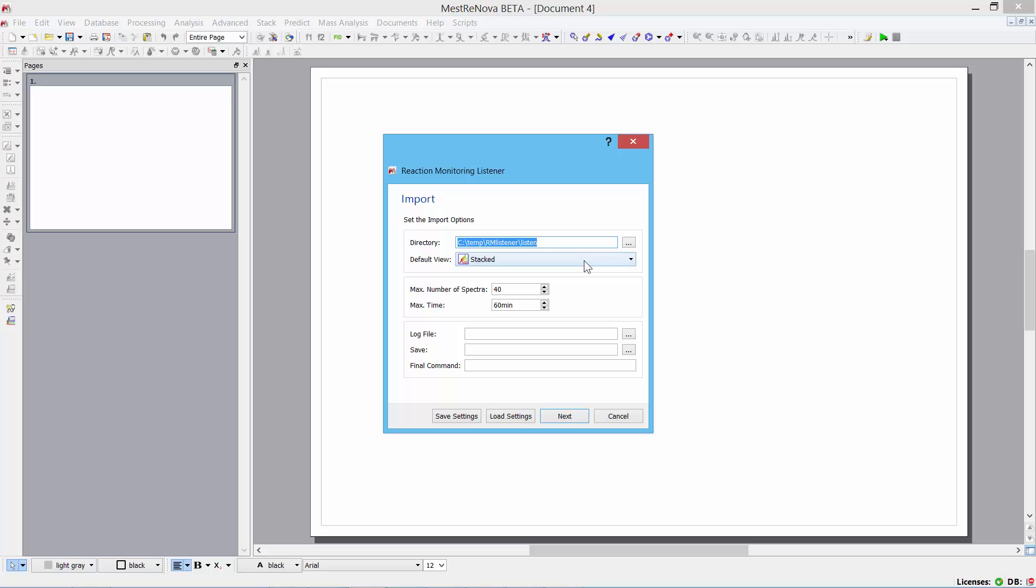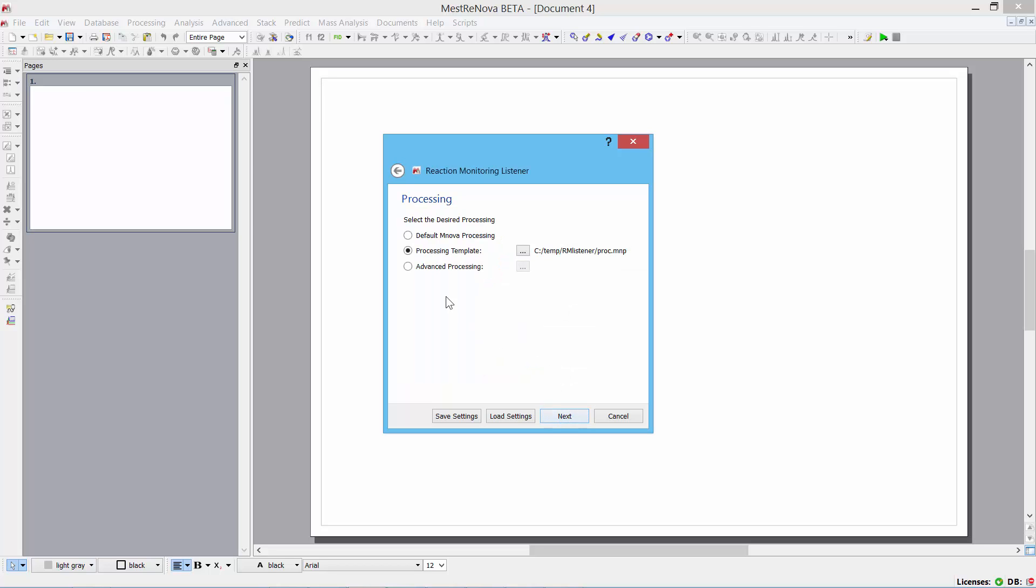And these are some conditions here that I can set some maximum limits. I can set some files to be written if I'd like. I can move to the next screen. And here I can specify a particular processing template to be used on each spectrum as it's imported into the project.